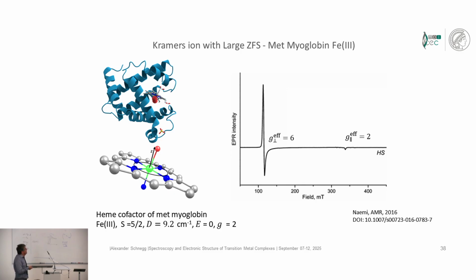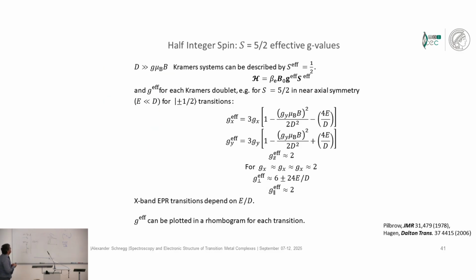And this comes from the fact that such a system can be calculated by assuming an, I call it effective spin, Dan today called it fictitious spin, whatever, effective is very commonly used, and calculate the EPR spectrum assuming an S equals 1/2 and modified g values.